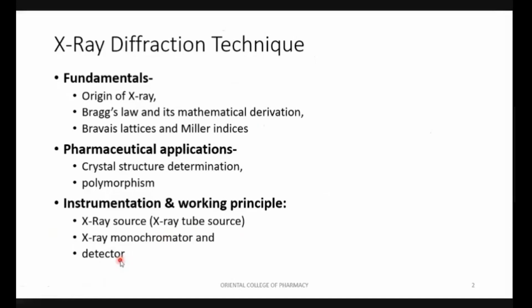And last is the detector. In detector, we will see the detectors we have just seen in the previous lecture. In radiopharmaceuticals, we saw two detectors. These are the same detectors used here in the X-ray diffraction technique.